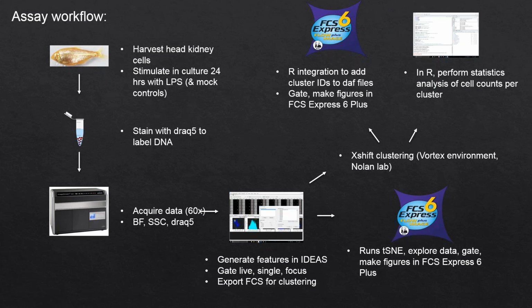Like Sean mentioned, FCS Express won't replace IDEAS, because you still have to go to IDEAS and do your feature extraction. Normally we're generating features in addition to the default features and setting all that up in IDEAS. I usually gate out dead cells or huge aggregates or things that I know I don't want to analyze downstream.